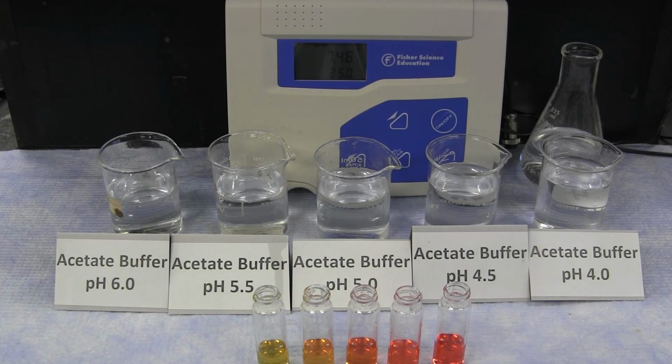All 5 of these solutions are the same buffer. They are all acetate buffer solutions. But by varying the concentration of the acetic acid and the acetate base, you can vary the specific pH that the buffer protects against. In the case of the pH 5.0 acetate buffer, the pH is buffered and will maintain a pH of 5.0, while the 5.5 buffer will maintain a pH of 5.5, given any sort of outside acid or base interference. These buffers play a critical role in a lot of biological processes, as many enzymes and proteins will only work at very specific pHs.